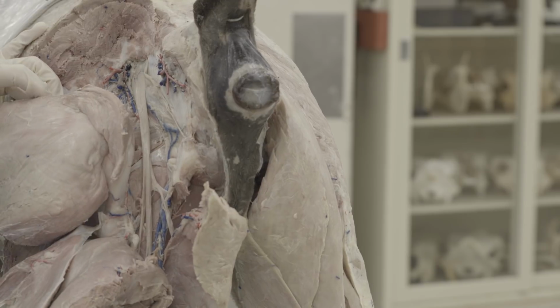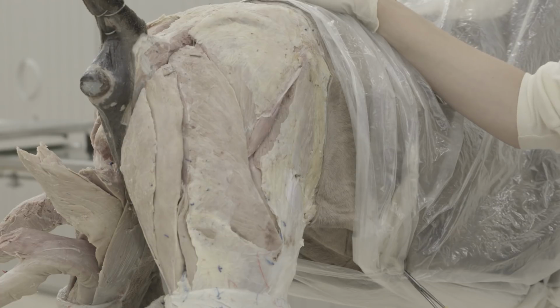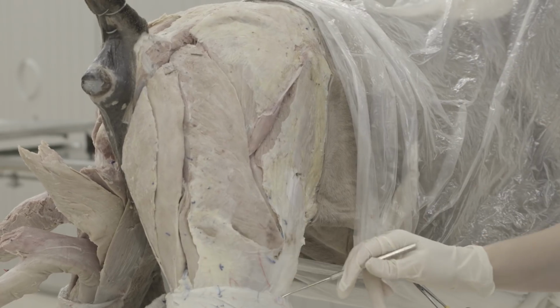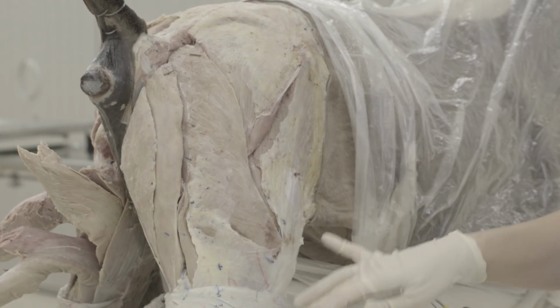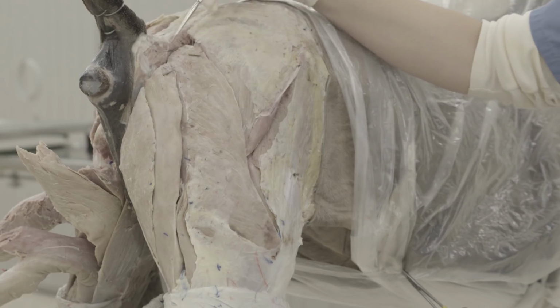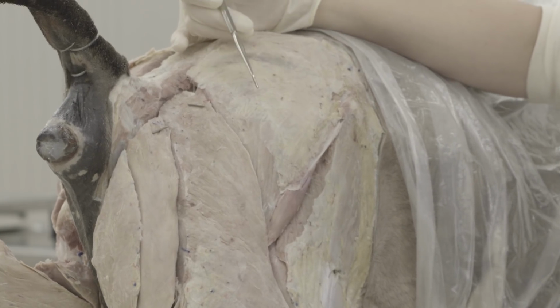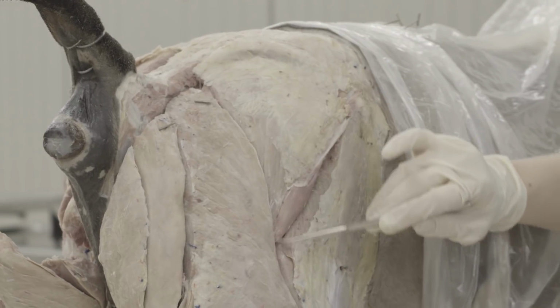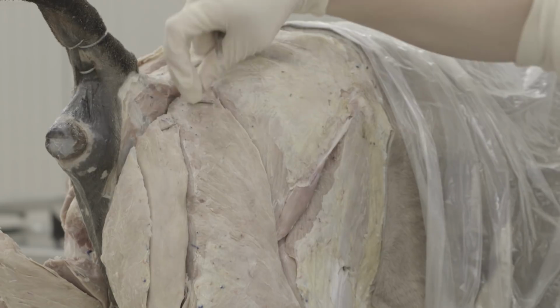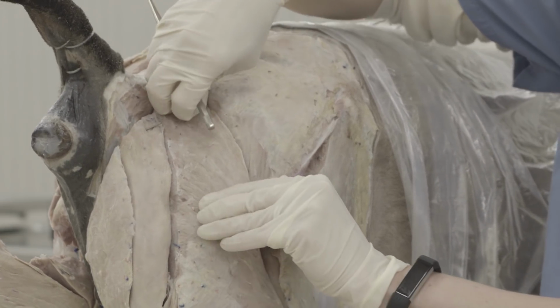Now we'll move to the right side and take a look at all of those structures again. So now we're looking at the right side of the pony, where you've done your skin reflection the same as the left side, so skin has been reflected down to the stifle area, and you're looking at the muscles on this proximal pelvic limb. So you have a lot of fascia, again, that has to be removed, and you have to find the borders of the muscles. So here's the border of the biceps femoris muscle. So you'll transect that proximally and then reflect it distally, just like you did on the left side.